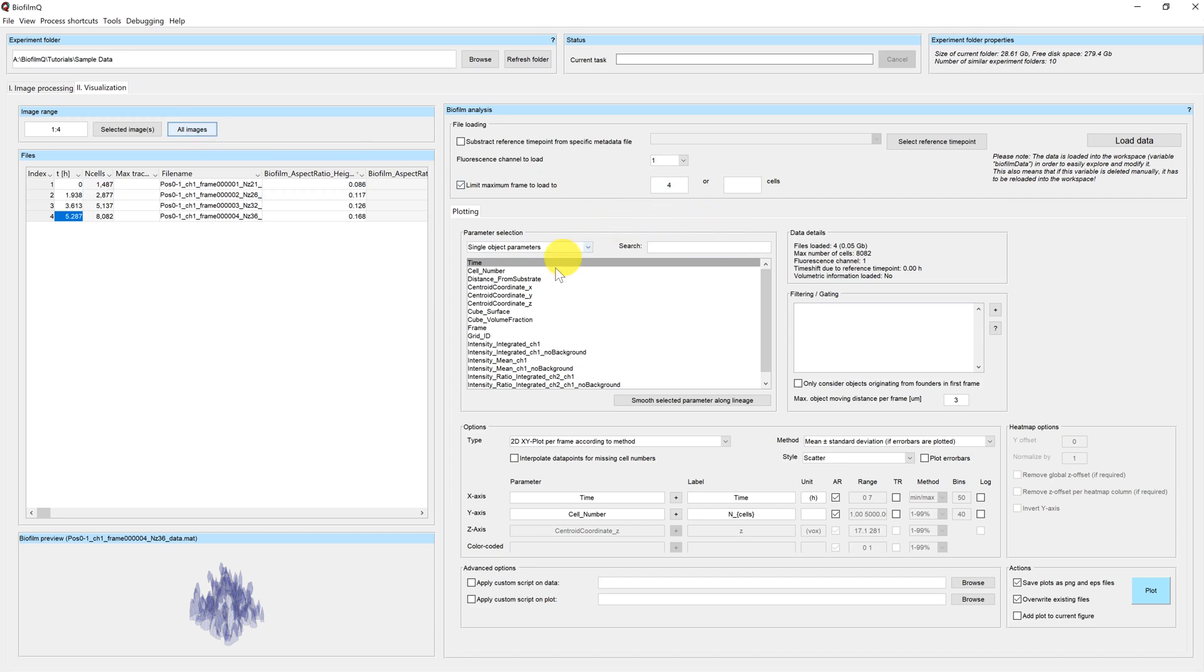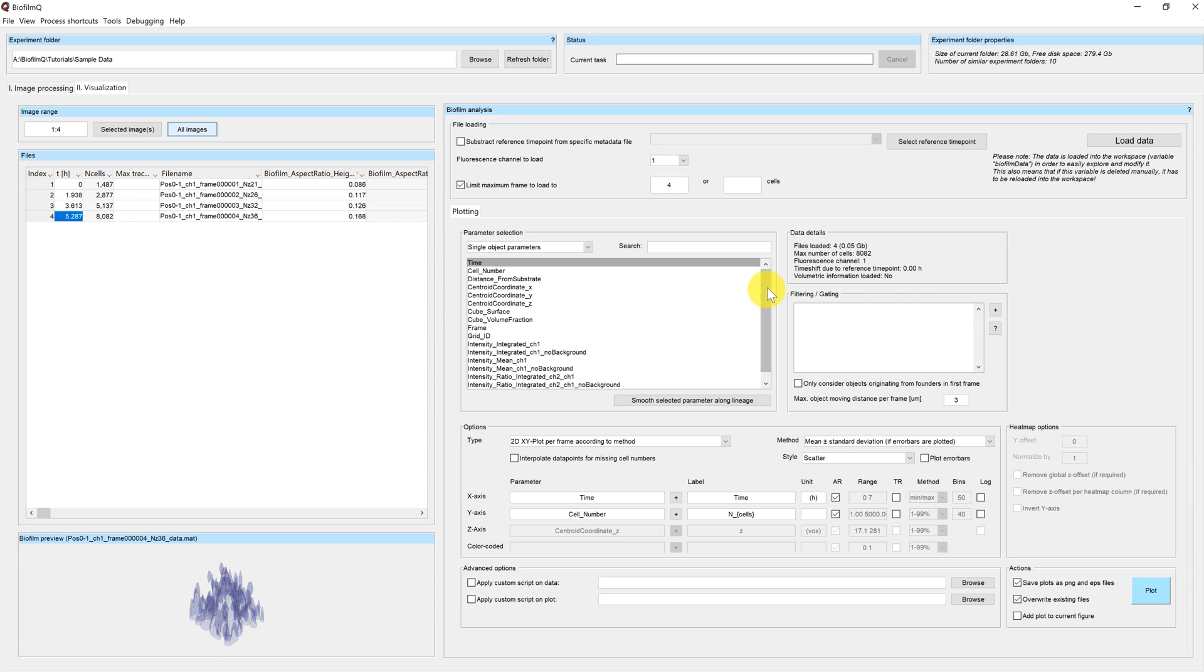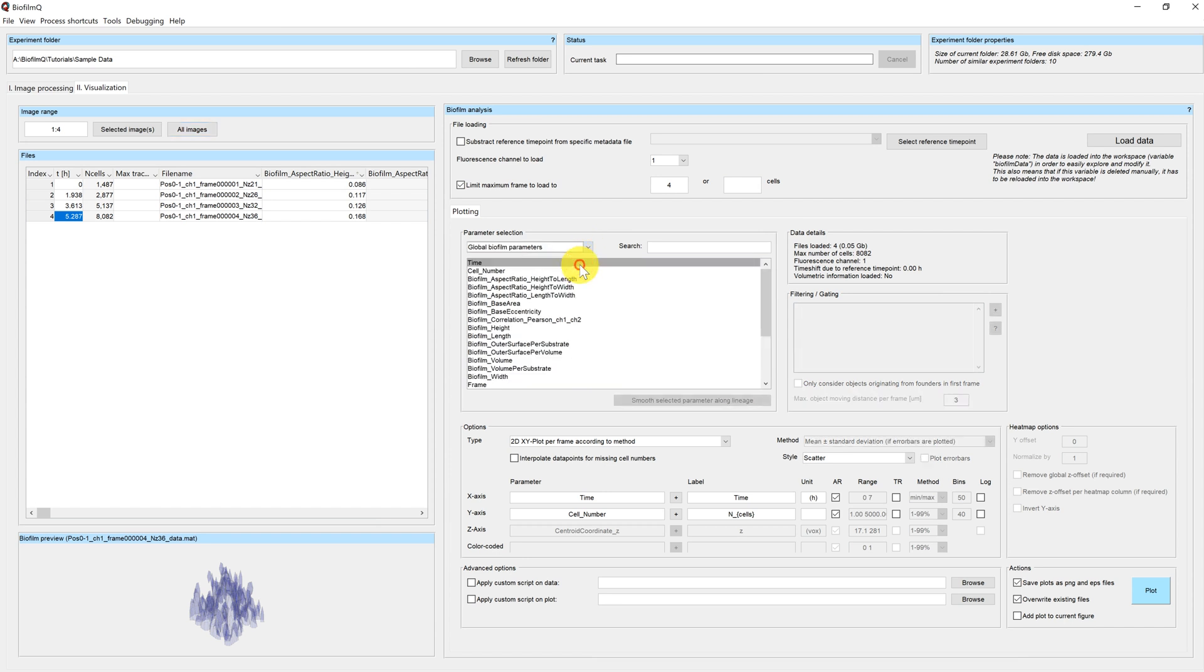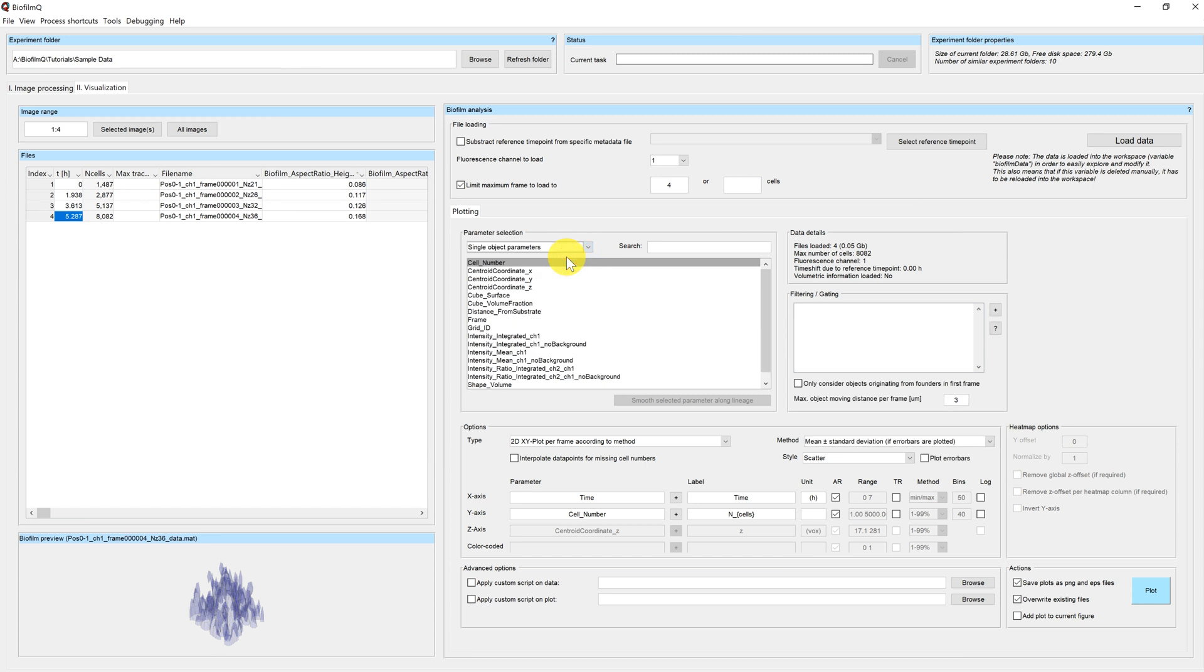Over here we have the different plotting options. There will be additional tutorials explaining in detail what all of these do. We will only have a quick glance at them for now. This table here summarizes all of the parameters that are available to me for plotting. I can choose to either plot global biofilm parameters, in this case only one number is calculated per time point, or I can look at single object parameters, where the parameter is calculated for each individual cube.